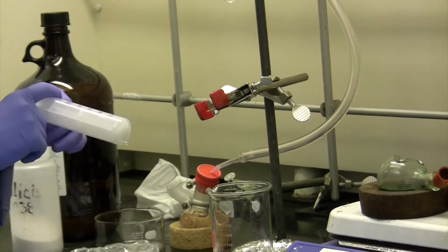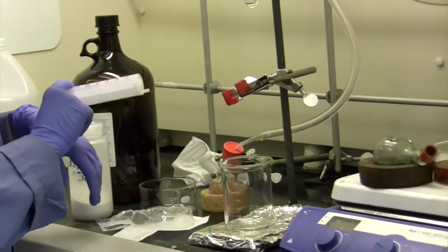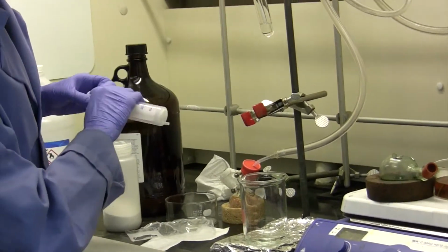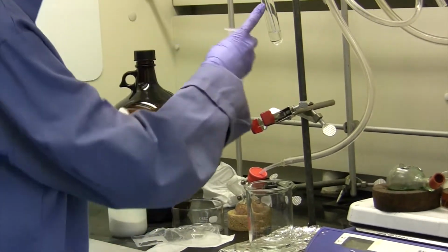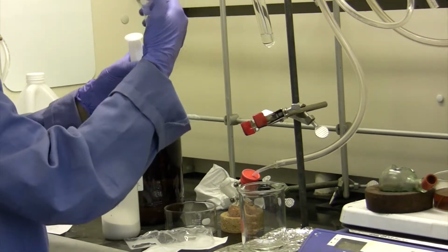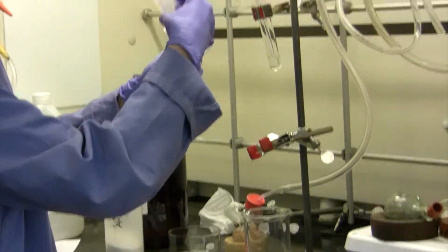And try and get as much of the chloroform into this flask to collect it as you can. You definitely don't want to be shooting it outside the hood at your lab partners. Okay. My cotton's already on the move.